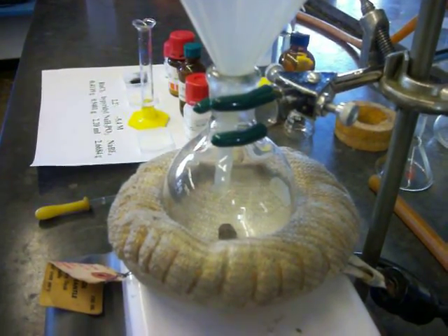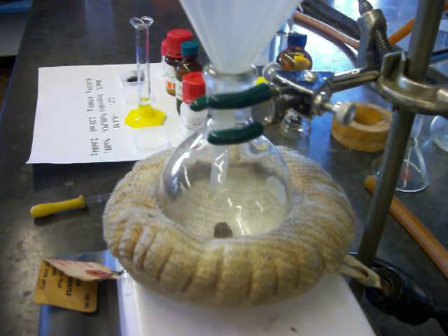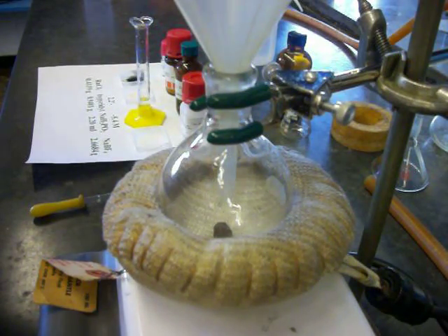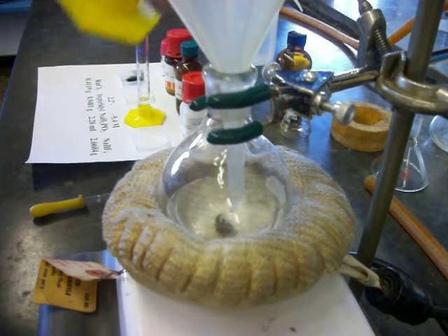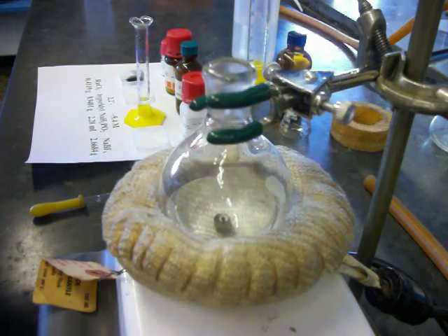Our reaction vessel is a 100 milliliter round bottom flask with a magnetic stirrer. First, I'm going to add most of my water in. I want to retain a little bit to serve as a rinse, since some of my reagents are fairly powdery, so I'm going to pour most of that in and replace my liquid addition funnel with a powder funnel.